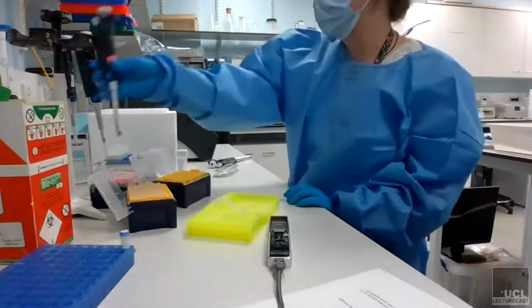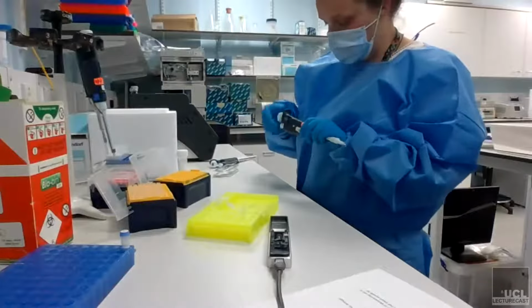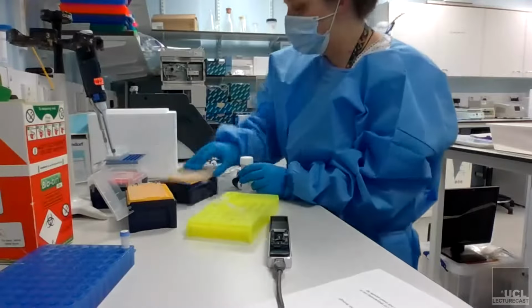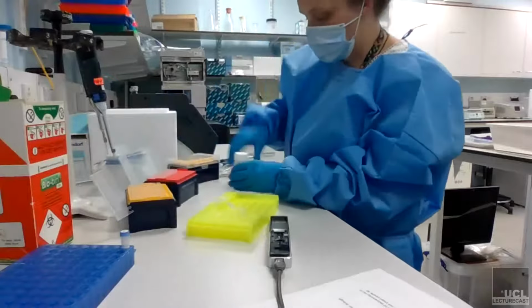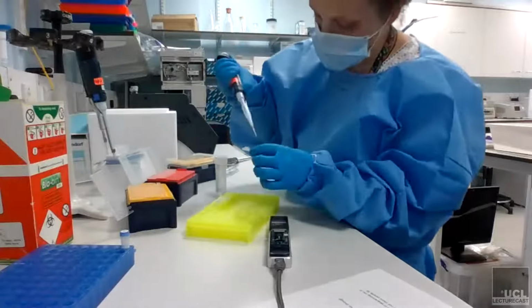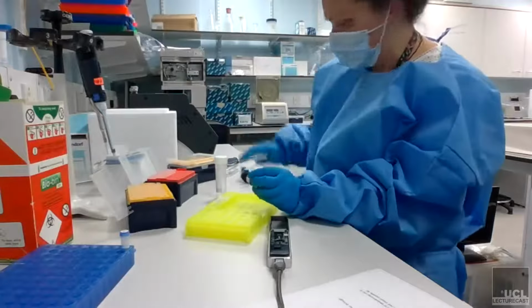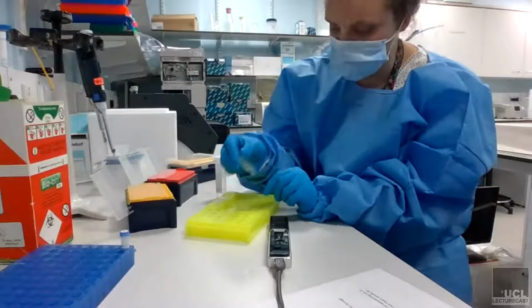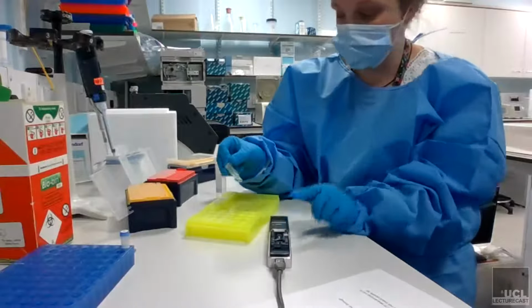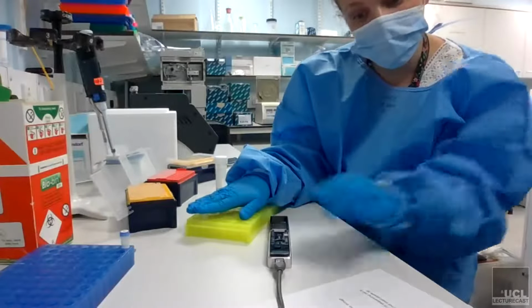Then we need to add 4.5 microliters of our water. And that is about 75 microliters of our prepared DNA library, which can then be added to the spot-on port. So that's ready to go.